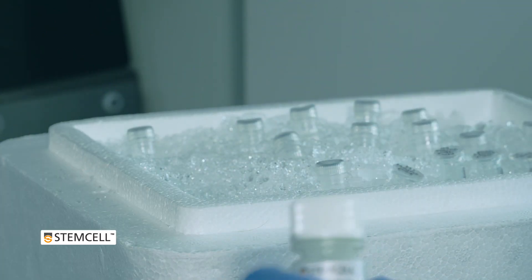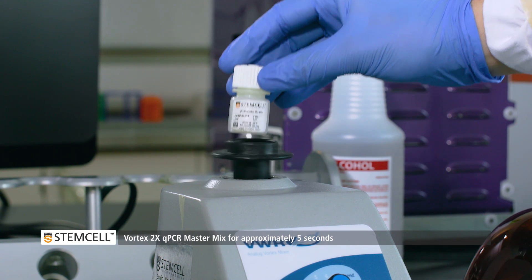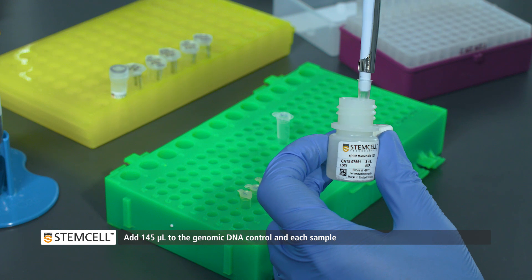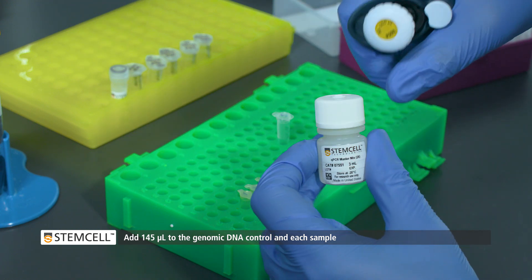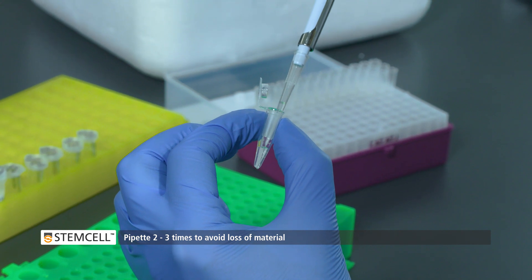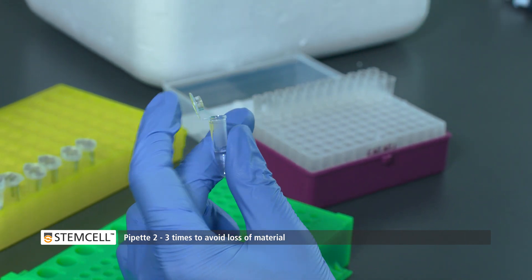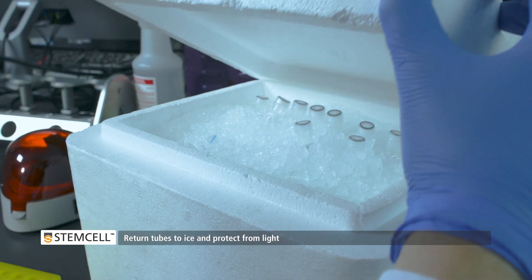Once all samples have been prepared, vortex the 2x qPCR master mix. Then add 145 microliters to the genomic DNA control and each genomic DNA sample. The qPCR master mix is viscous, so once added, pipet up and down carefully 2-3 times to mix. Then place the tube back on ice and protect from light.